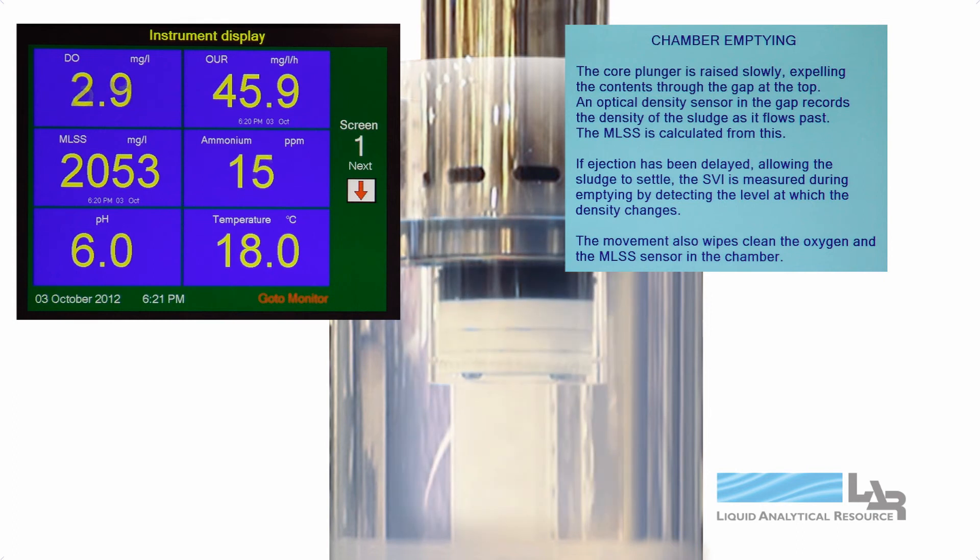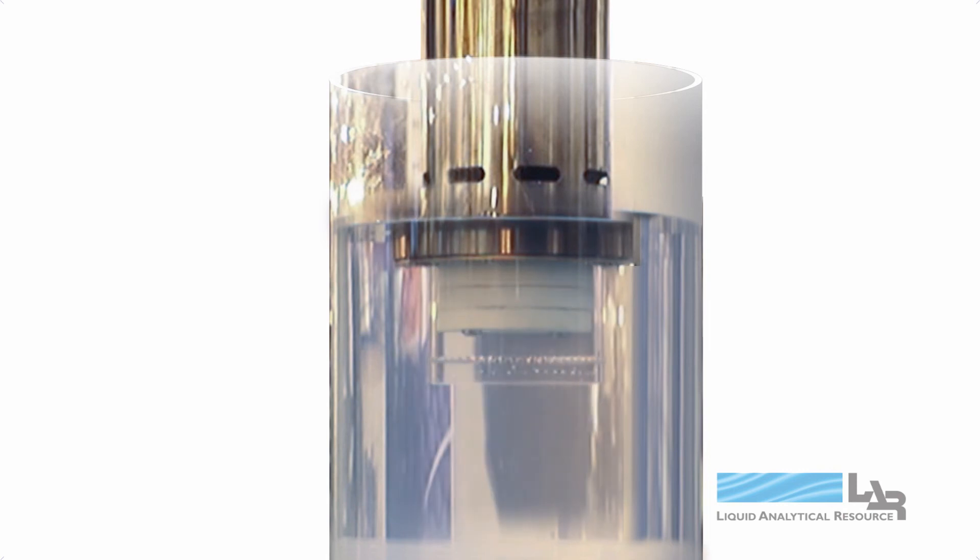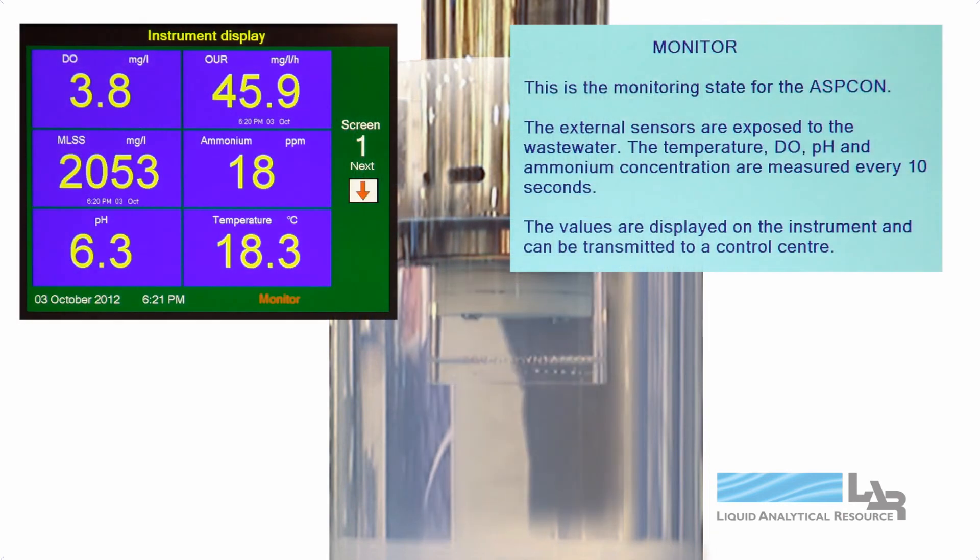If ejection has been delayed, allowing the sludge to settle, the sludge volume index is measured during emptying by detecting the level or density changes. The movement also wipes clean the oxygen and MLSS sensors in the chamber.